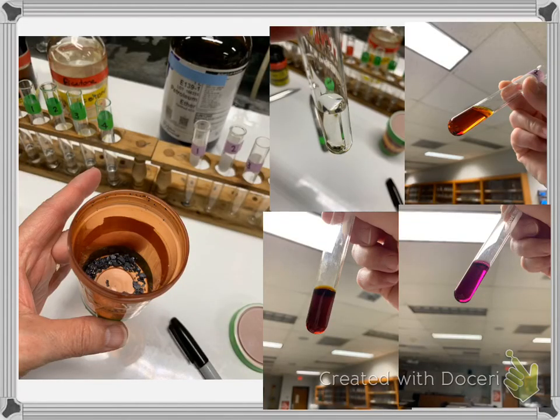Now the last one, again, I wish we were in lab to see this because I think that you would think it was cool. This is iodine, and iodine is one of the few nonmetals that are shiny solids. I held it up there so you could get a glimpse at it. I used really just one little teeny tiny crystal in my examples. And I had water, ethanol, acetone, and pet ether.